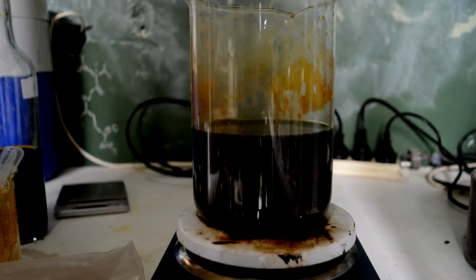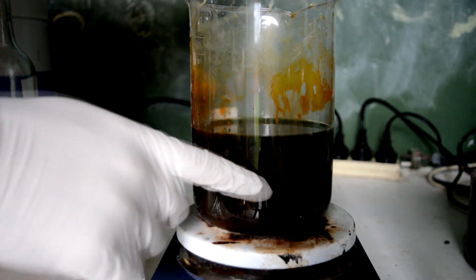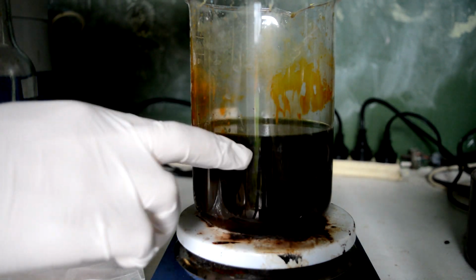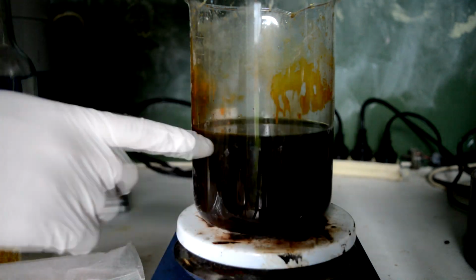Alright, amazingly it is actually working. But we can see as all the red stuff settles that it's really green up the top here. So I think there's still heaps of copper left in terms of how much chromium versus how much copper is in there.